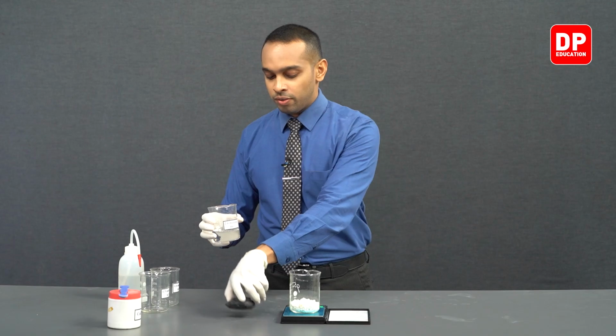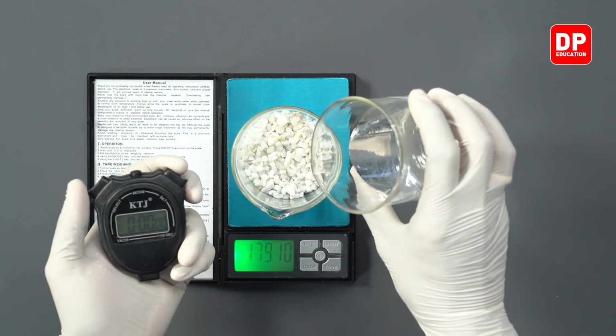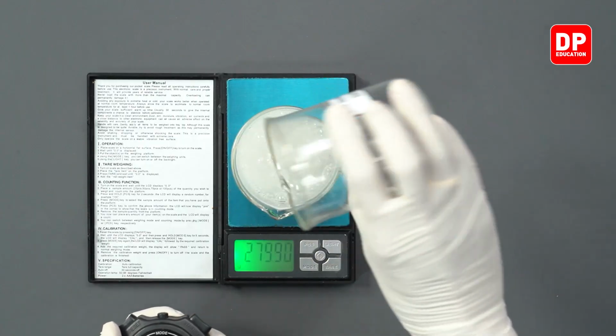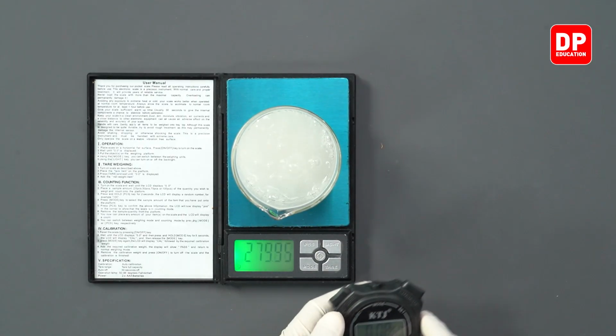solution, and we can add this HCl solution while we turn on our stopwatch as we did before. And then we are going to take the mass readings every 20 seconds.